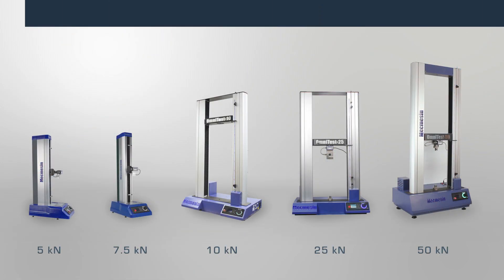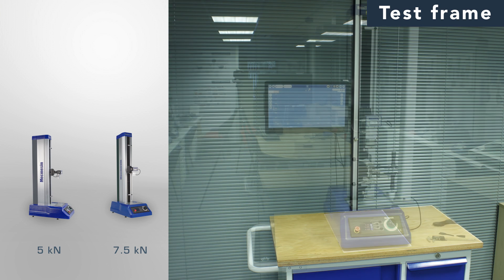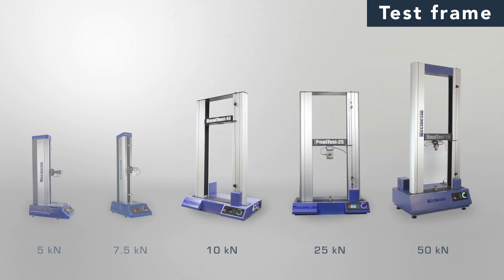Simply choose the most appropriate model from the OmniTest range based on your expected maximum load. Single column frames are rated to 7.5kN and prove very popular as they occupy minimal bench space.